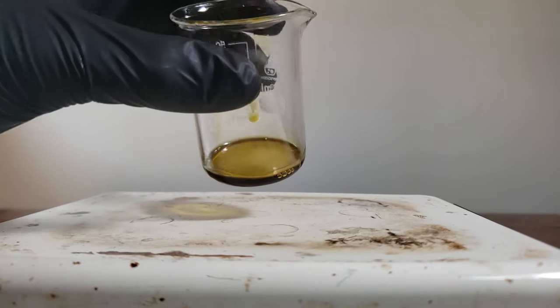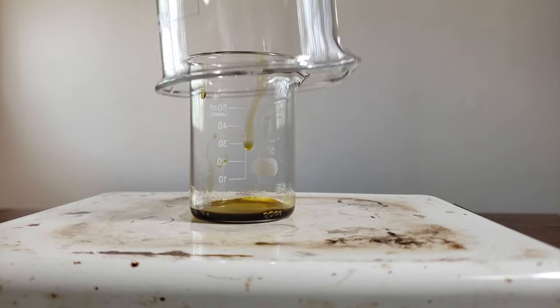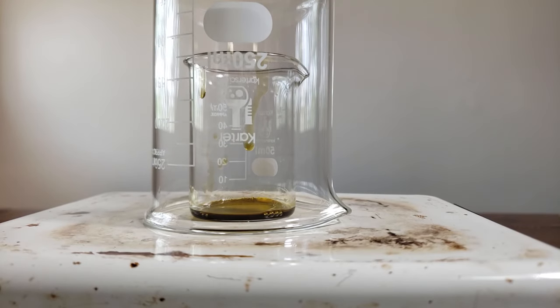After you've reduced most of the alcohol out, I like to put another beaker on top to prevent any volatiles such as terpenes from escaping that haven't already. In this final process, you're removing the last of the ethanol. Now, you can't truly remove all of it without a vacuum, so I like to do this for as long as possible at a medium to high heat.